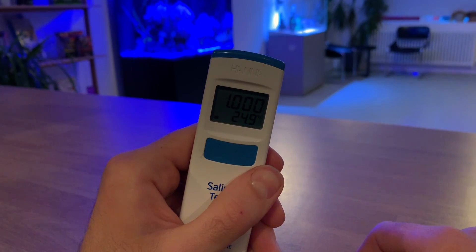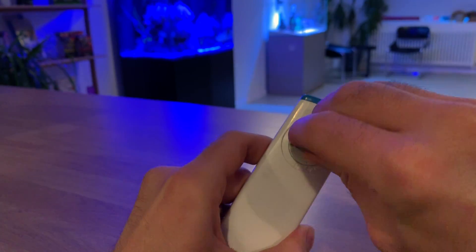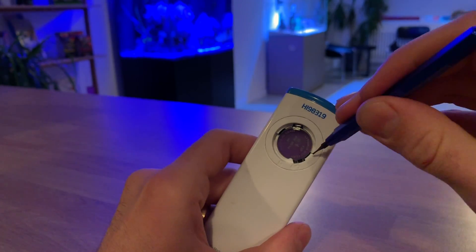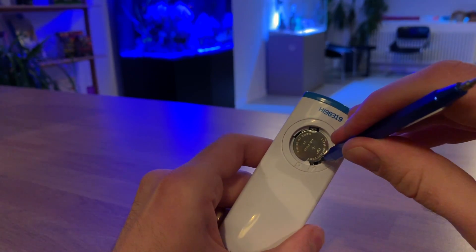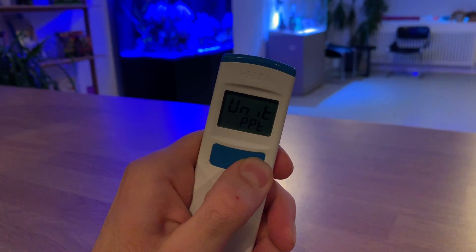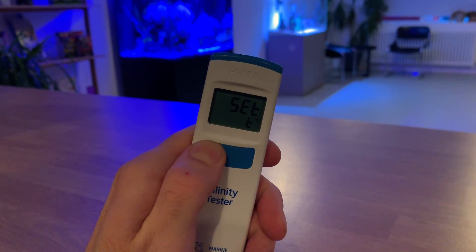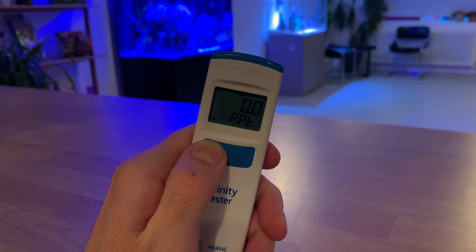It is possible to change the unit measurements for salinity and temperature using the third button located in the battery compartment. Once the settings mode has been activated, simply use the calibration button to switch between unit types — in this instance, specific gravity and parts per thousand — then use the power button to save these settings.